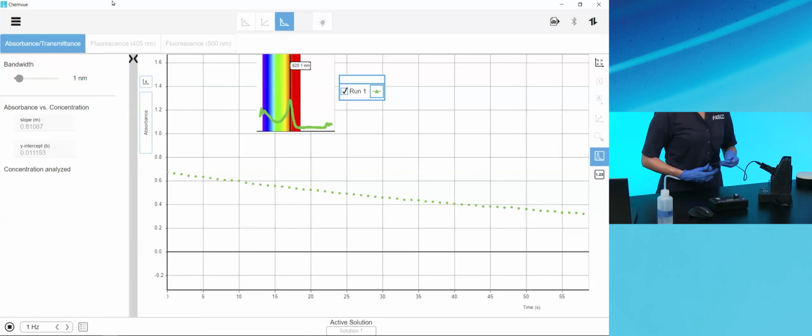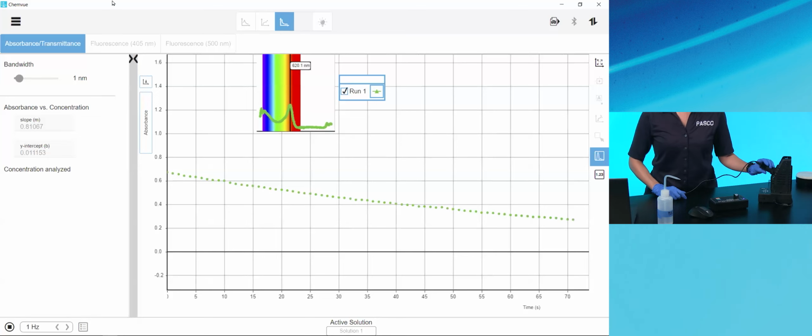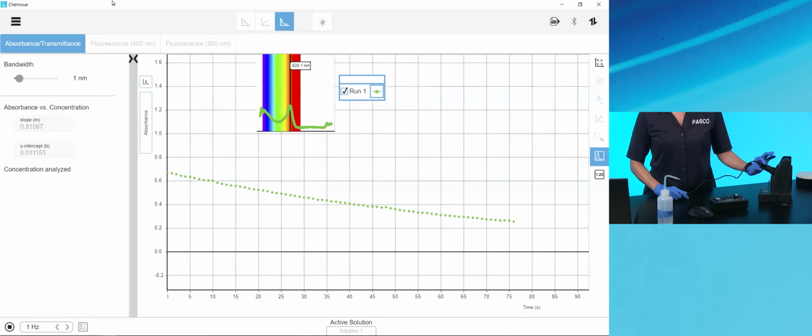The thing I love the most about the melting point apparatus is that while it comes with an ordinary eyepiece that you can look at to see the crystals melting, and you can measure the temperature with the software, you can also swap out that eyepiece for an optional camera piece, and it works with the software to coordinate the visual melting with the actual measured temperature.